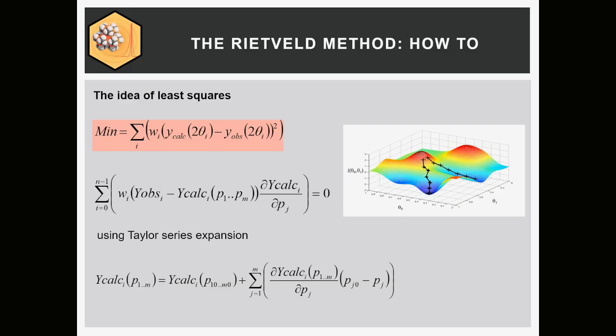Some parameters are easy because they're linear. They go down like hell, and they end up in the minimum. Most parameters are highly complex, like the surface of the Earth. This makes Rietveld refinement challenging.